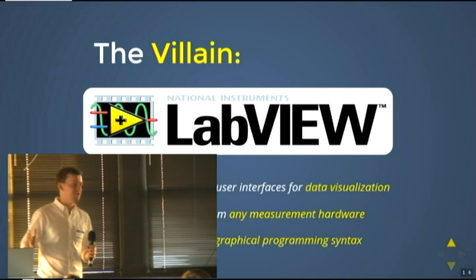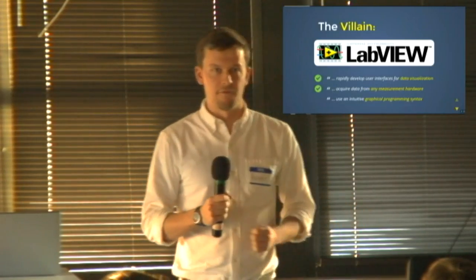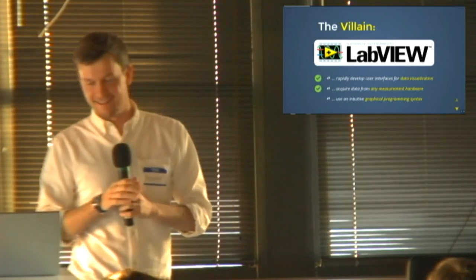So I pulled a couple lines from the promotional material on their website. First, it actually is pretty easy to visualize data with LabVIEW. You do a measurement, you slap up a plot, you can see what it looked like quickly. It is also easy to talk to hardware with LabVIEW. That's the whole selling point, basically. It's an industry standard, so any piece of equipment that you buy, the manufacturer is going to provide a LabVIEW library for it. This last part, the intuitive graphical programming syntax.